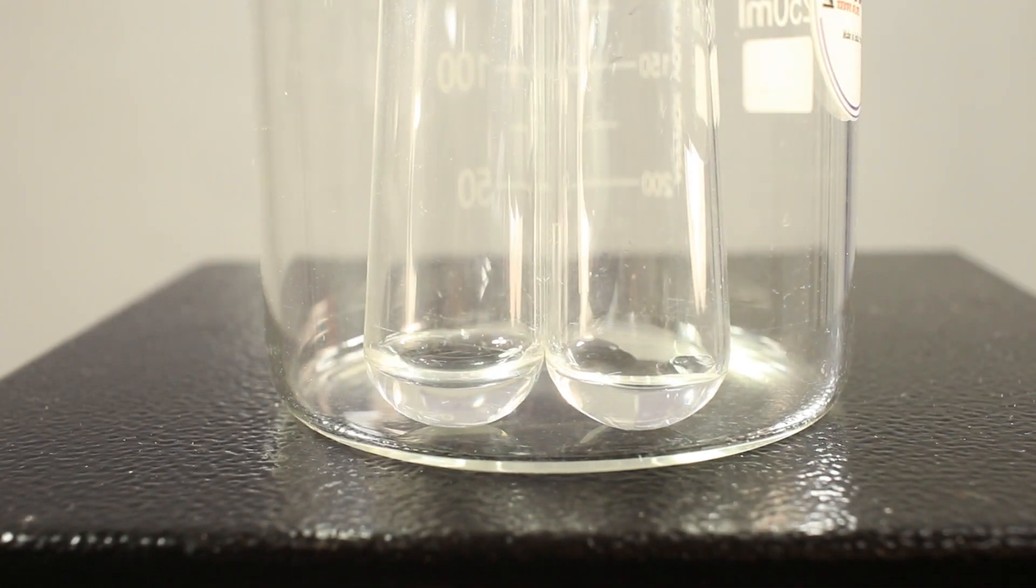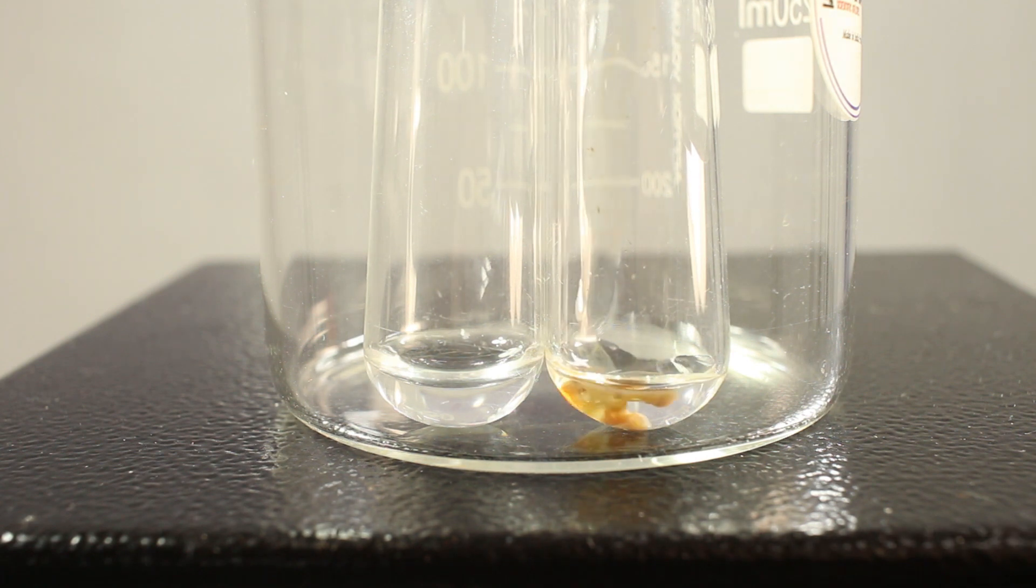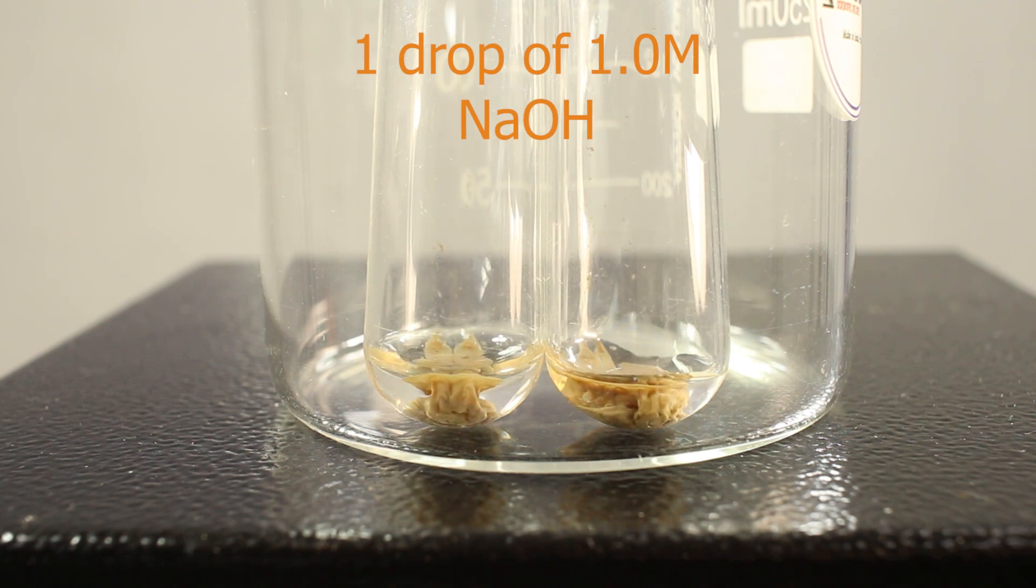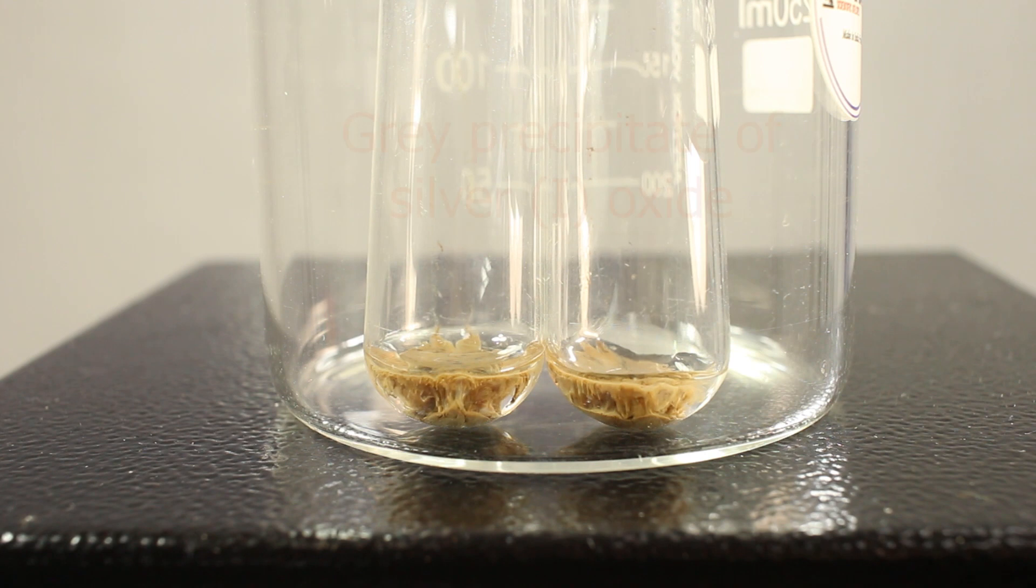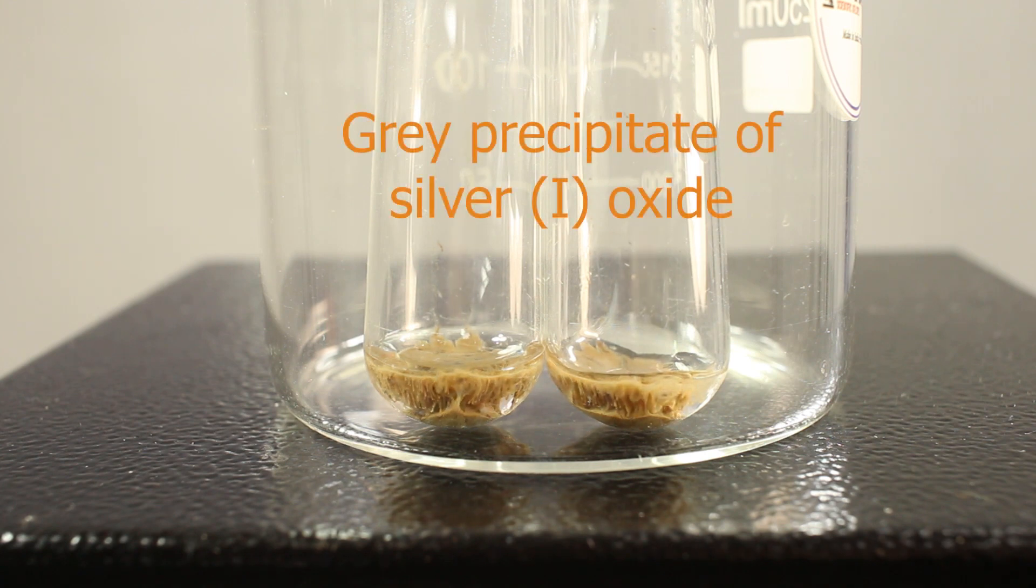Now we're going to put one drop, would be enough, of sodium hydroxide in each. You see, silver oxide or hydroxide is insoluble, forming brown-grey precipitate.